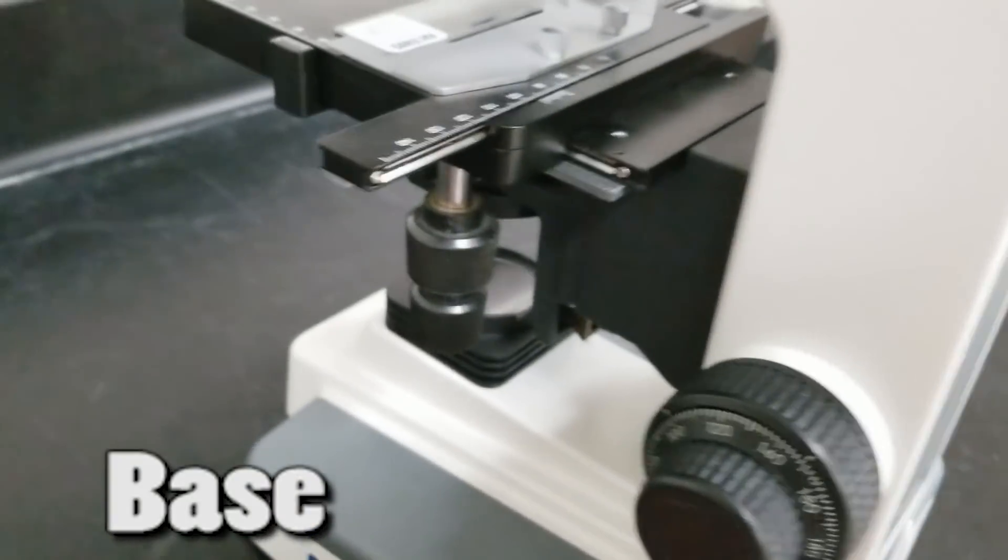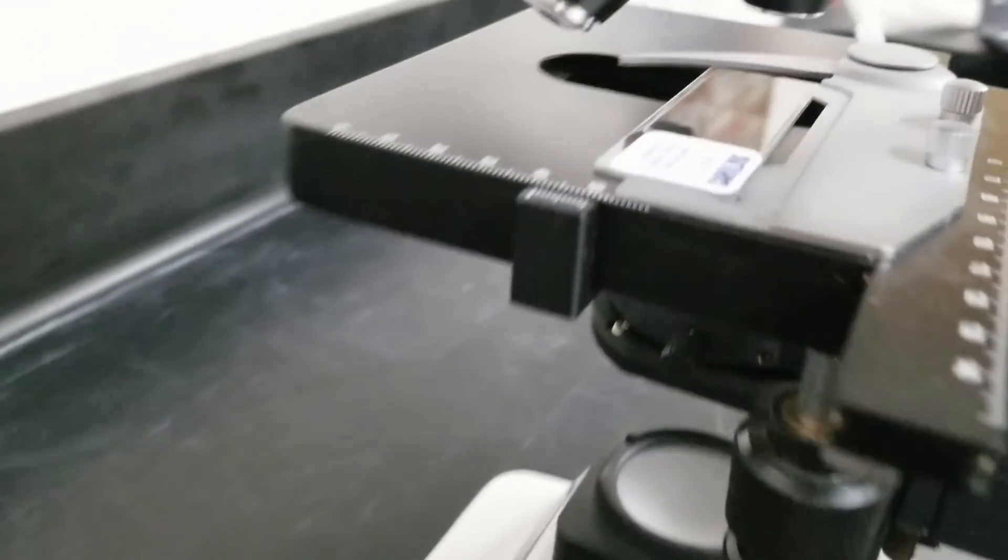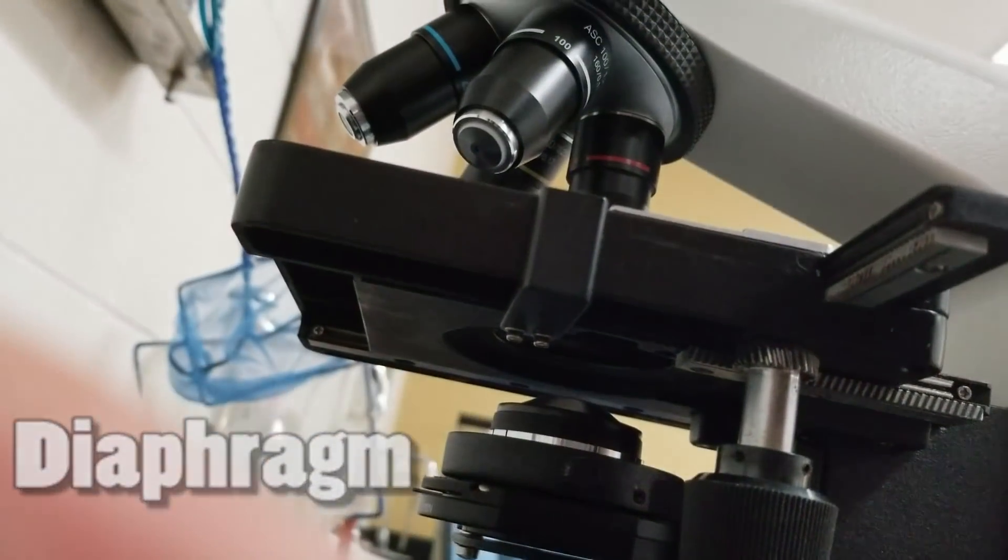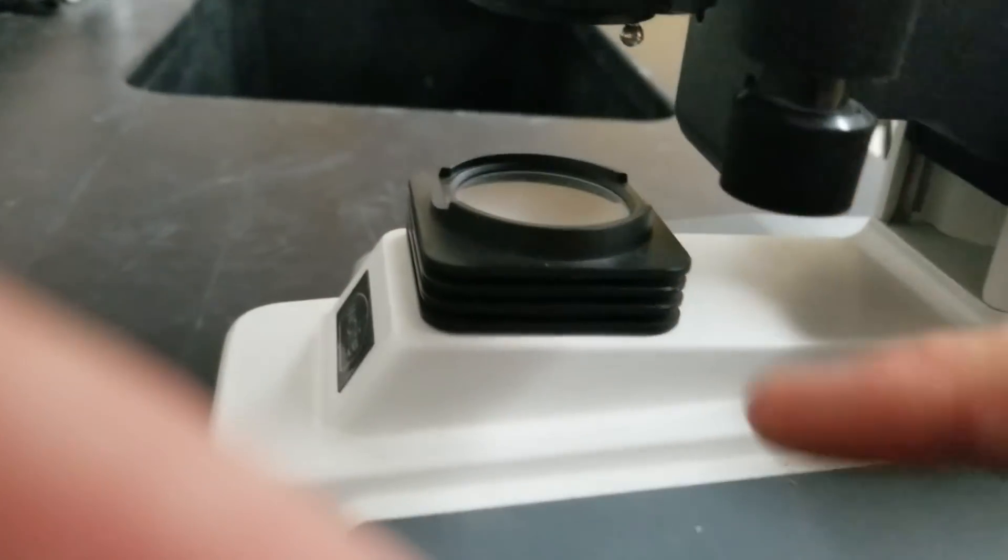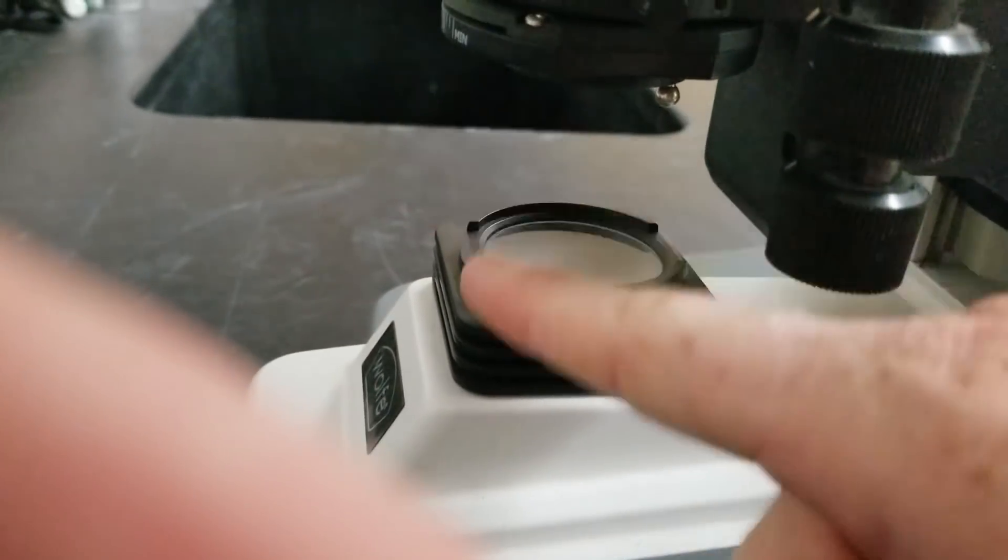Base is right here. There's a thing called a diaphragm, which is what allows light to come up into the slide. And then down here you have your actual light.